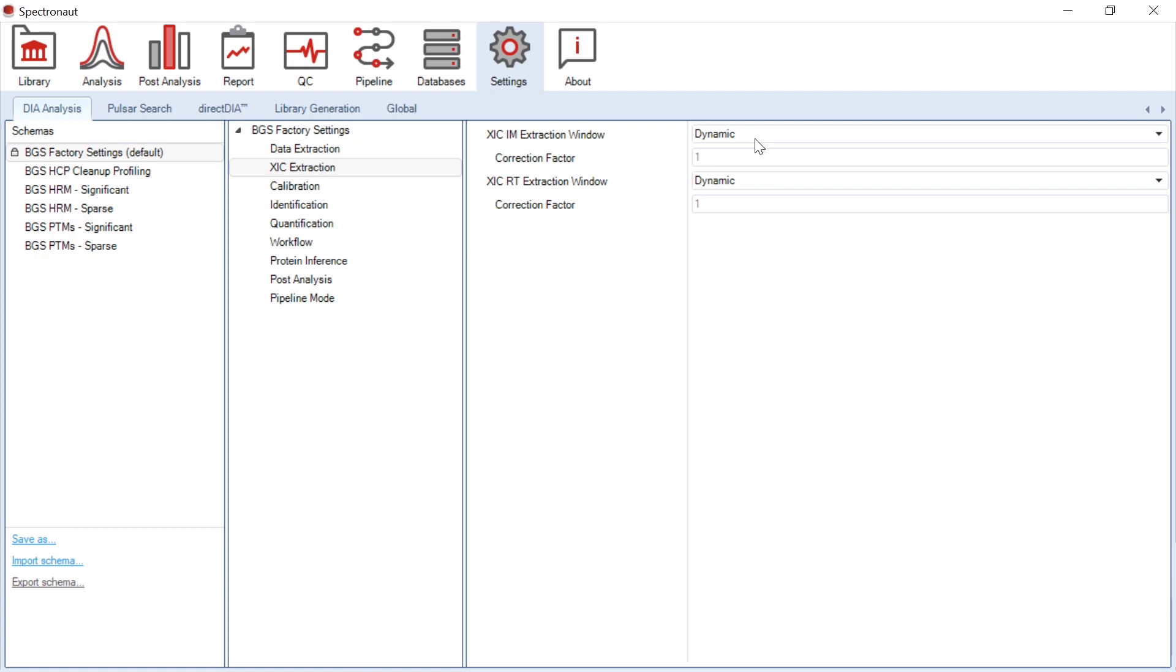If needed, a correction factor can be applied. For example, a factor of 2 would mean that you want to use 2 times the window that Spectronaut suggests. The default settings are recommended for most applications.